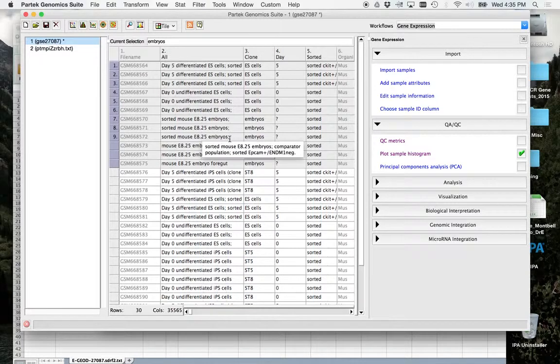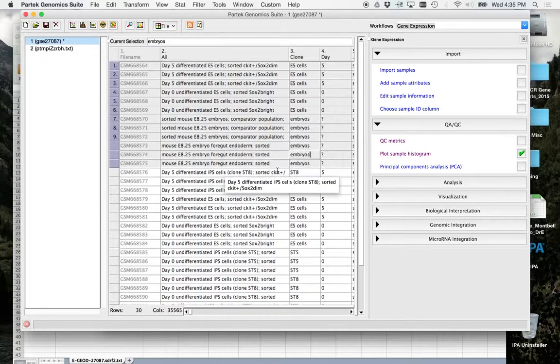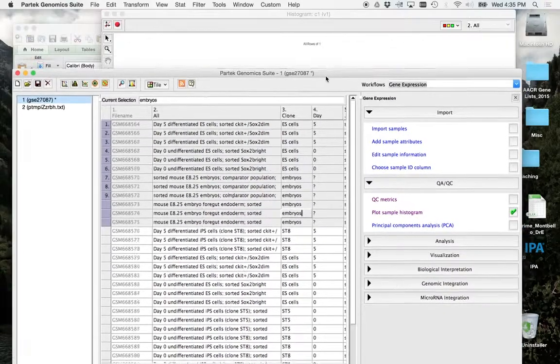So these are much different. These up here should be the same. You've got ESC cells, but you also have ESC cells down here. If you look, there doesn't seem to be much difference. Something's going on here. We have 2 distinct populations of cells, and you're going to see that once I do the PCA plot.